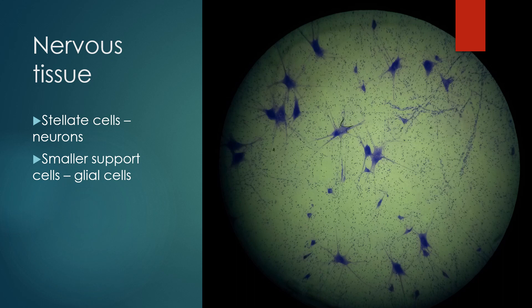These cells here with projections—those are going to be dendrites or axons of the neurons, and then the main part of the cell is known as the soma or the cell body. That would be a neuron, and then these much smaller specks that you see are going to be the glial cells, the support cells.